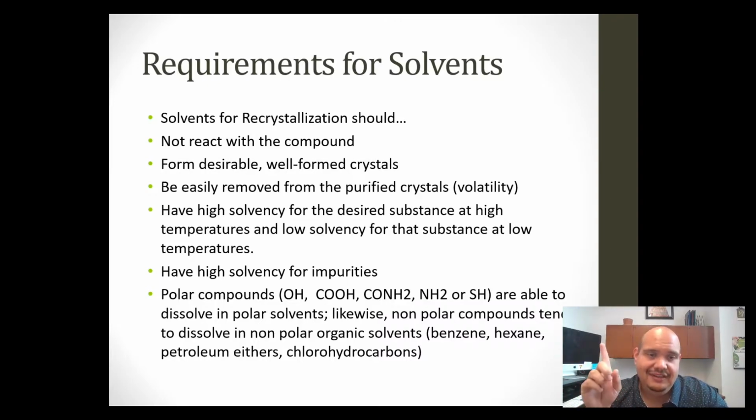Last note that I want to mention: polar compounds, such as a compound containing any one of those functional groups, or those little chemical branches for now, in case you aren't familiar with what a functional group is, are able to dissolve in polar solvents. And likewise, nonpolar compounds tend to dissolve in nonpolar organic solvents like benzene, hexane, ethers, whatever. But it's still important that your solvent is not so high in its solvency that it will super dissolve your solute or your solid in itself.